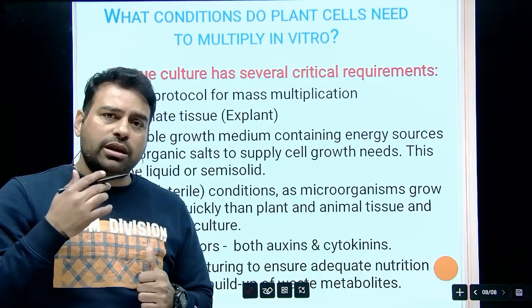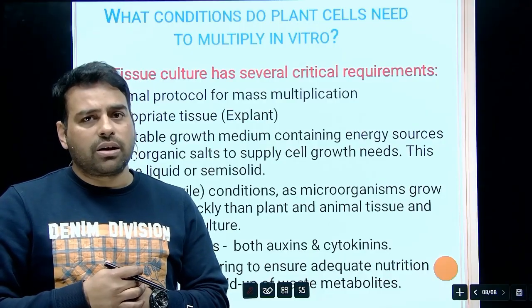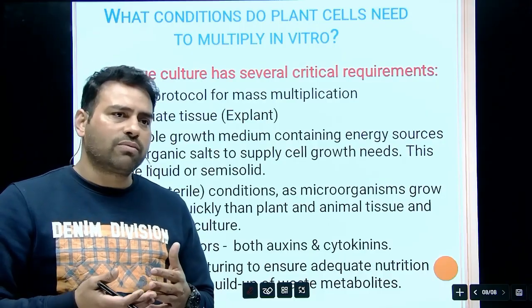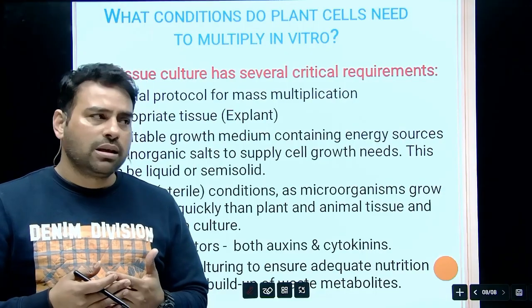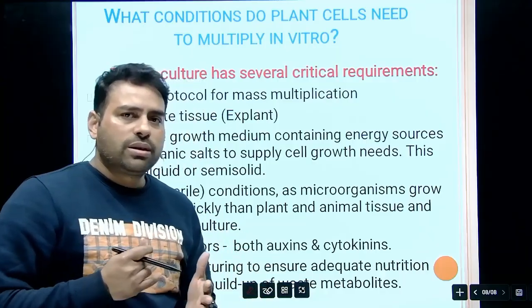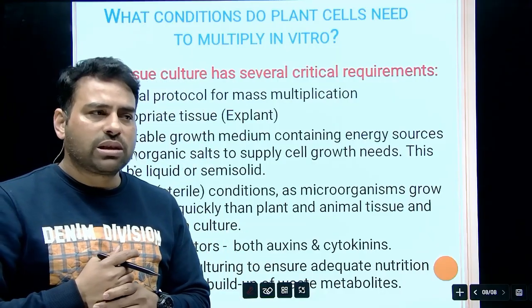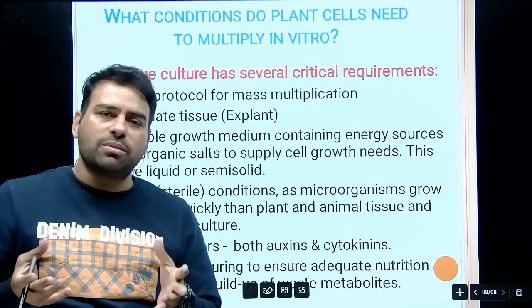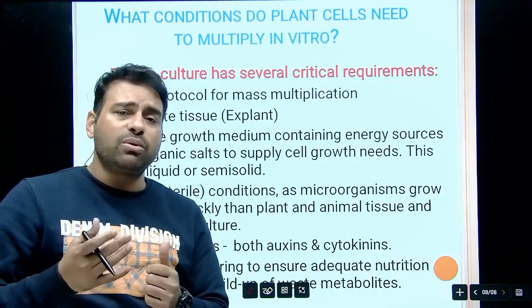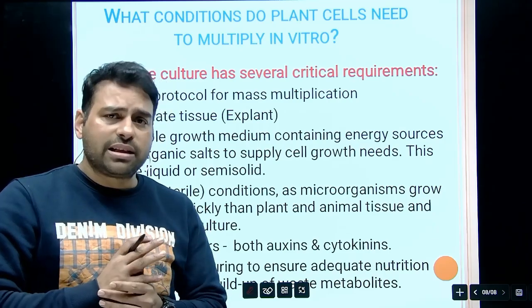Protocols also differ according to the requirement of the micropropagation or purpose. Likewise, if we want an experiment of plant tissue culture for the production of secondary metabolites, then we have to use some semi-solid media. We have to use agar in a lower concentration.